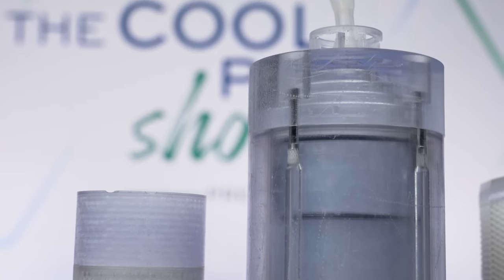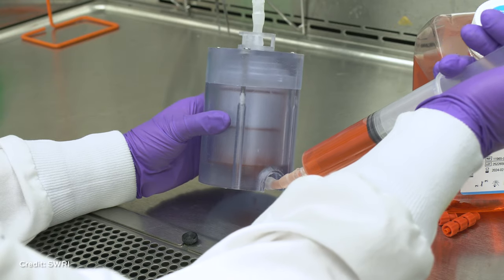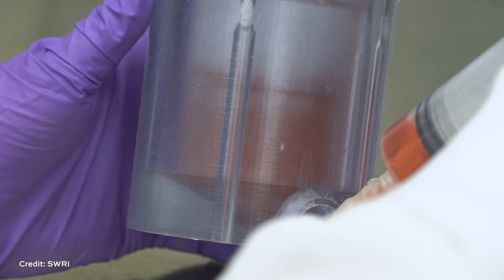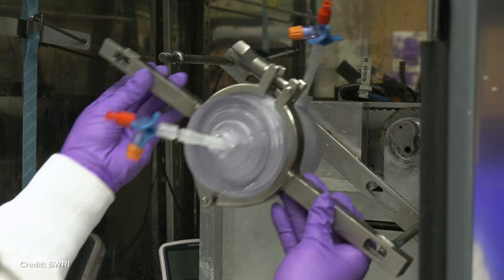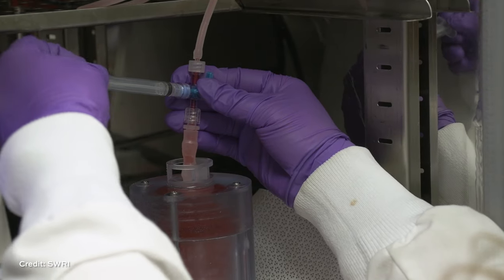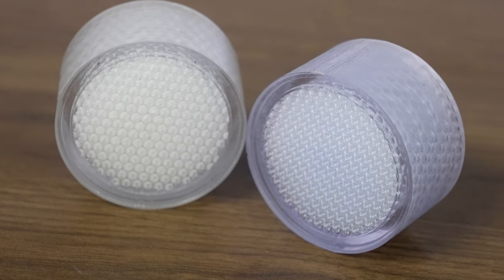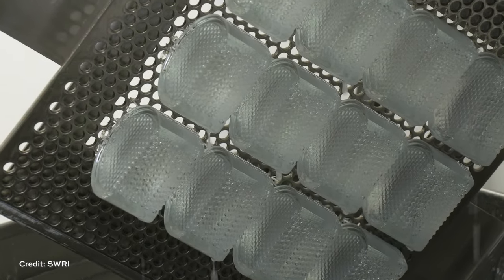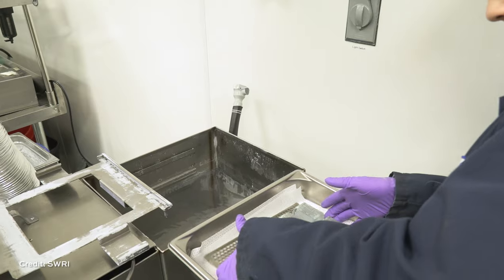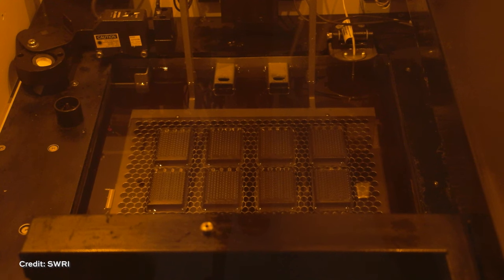A bioreactor can be thought of from a high level as a chemical reactor — a chamber where biological processes take place inside a closed system. Our bioreactor is used for growing cells, where the process of growing cells or possibly secreting things from those cells happens inside that closed system. The most important and novel part of our bioreactor is the scaffold that we grow our cells on. The scaffold can only be made through 3D printing. We use a commercial-level SLA VAT polymerization 3D printer using off-the-shelf resins. SWRI has actually developed some post-processing techniques to make these scaffolds pretty material agnostic.